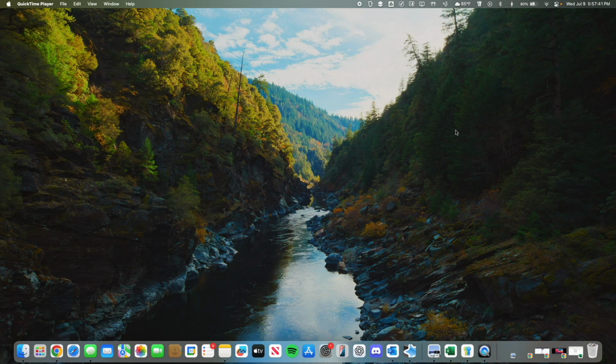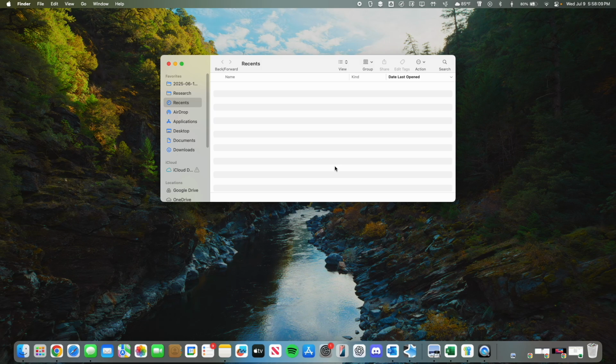Once you have been able to install Fiji, which is just ImageJ with a few more plugins that are bio-oriented, the next thing we're going to have to focus on is finding an area to store all your files. For most people, the files being transferred from the microscope are likely to be very large, and if possible, you might not want to store them on your laptop if you don't have enough space. As such, I have all mine stored on Google Drive.